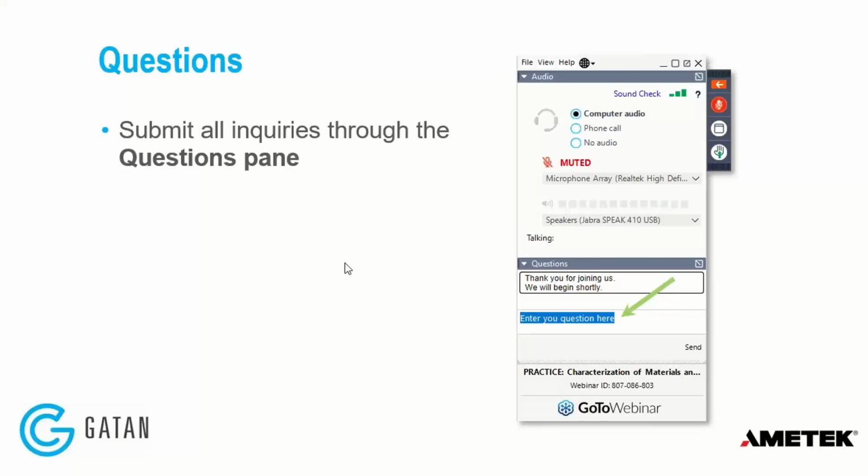We'll do one more question. Regarding CL analysis, does it have a library to further check on the phase structure of materials, or is there any standard material for verification? Right now, the answer is not yet. We're actively building a library of CL spectra so that when researchers find something, they can rely on that in order to identify those materials and what phase or condition they're in.